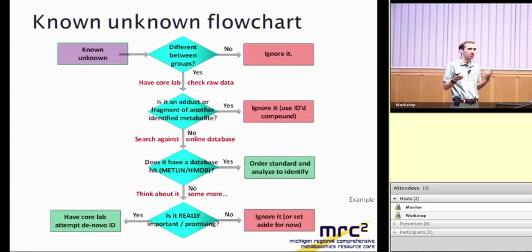There is some effort in the field to do this in a more automated process, but it turns out to be challenging. It's hard to put a computer algorithm together that can do the same thing as an experienced mass spectrometrist looking at a spectrum and saying, what does this look like to me? Is this really an adduct? Is it really something that's new, or do we just not know? So we annotate, but we don't do anything formal to fuse it together other than marking it as something that looks like an adduct of X.